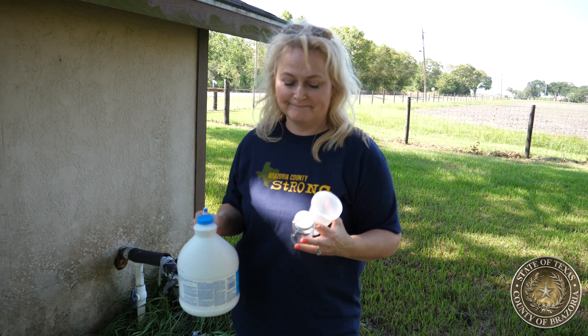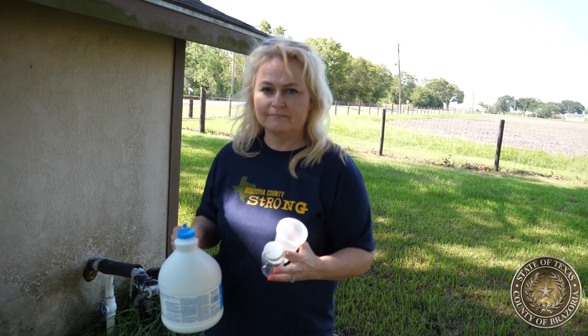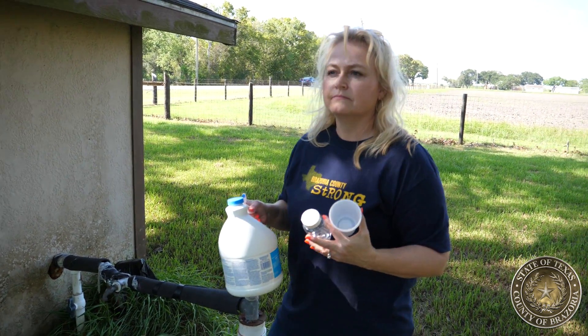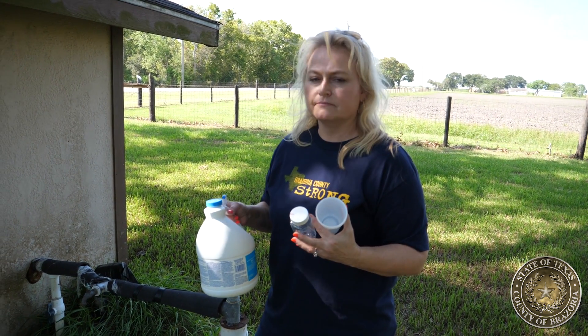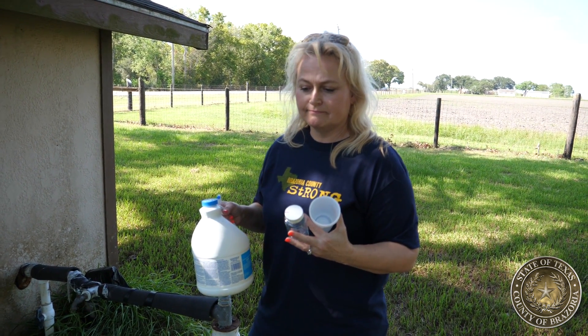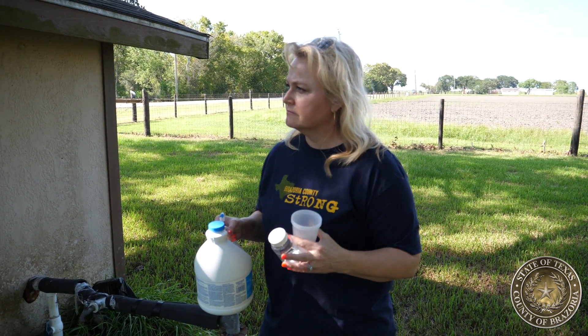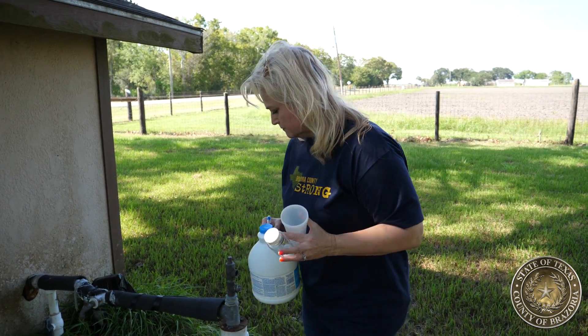We're here with the Brazoria County Health Department to give you some instructions on how to properly collect water samples from a private well for submission for testing with the Brazoria County Water Lab Department. They will test to make sure that your drinking water is safe to drink after the flood and Hurricane Harvey.